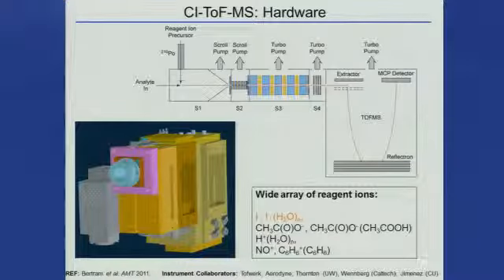Okay, so how do we do this from the measurement of the N2O5? We do this by chemical ionization time of flight mass spec, and so this is not necessarily a handheld mass spec. It's a little bit larger than that. The TOF on this is about the size of a shoebox, and that's manufactured by TOFWERK in Switzerland. And we've worked with them and Aerodyne out of Boston to work on interfaces to be able to make these chemical ionization front ends that can work toward very specific measurements of these trace gases in the atmosphere.